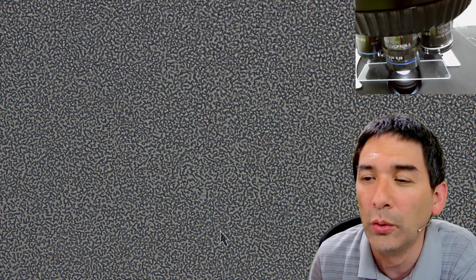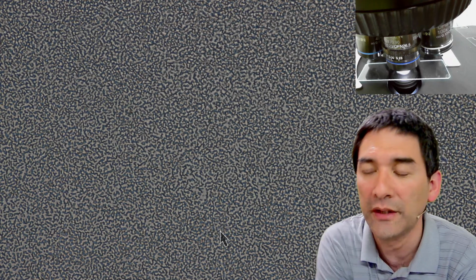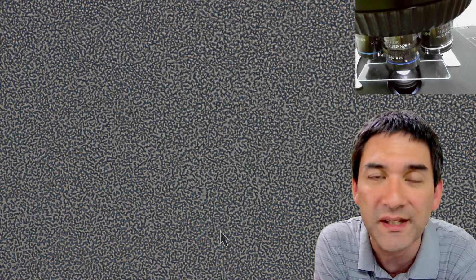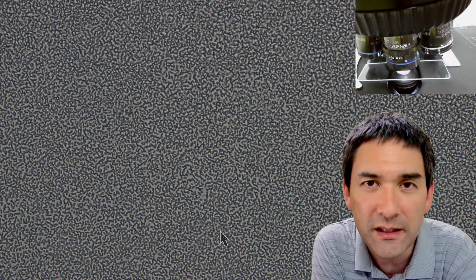So what is your oldest microscope? Not from when you got it, but from when it was made. My oldest microscope is an Olympus CHA microscope. I think it's from the 1980s.